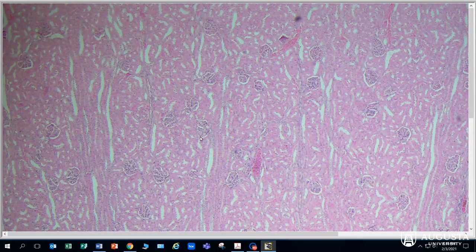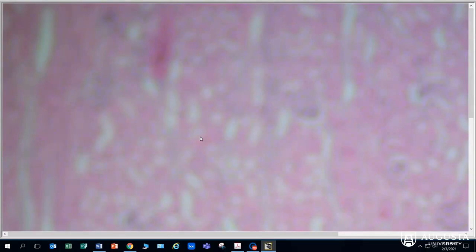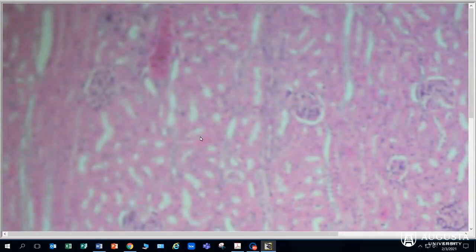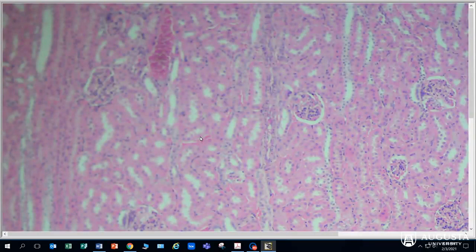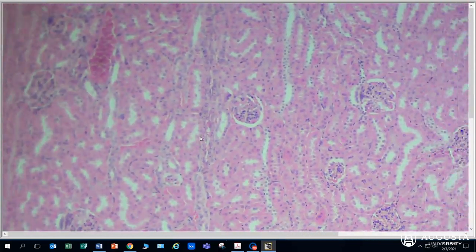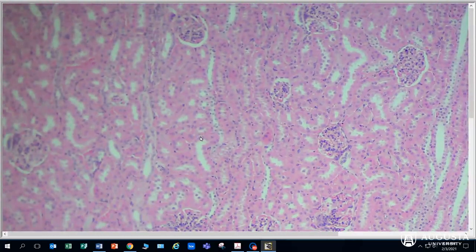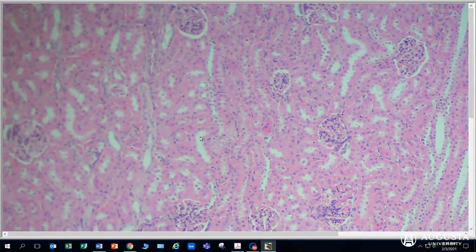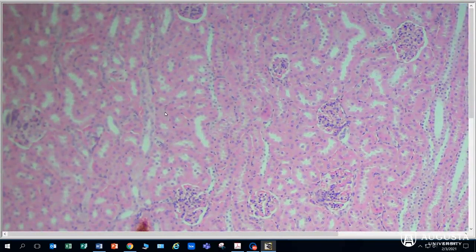We're going to pick one. Right now I'm looking at the 4x objective. If we switch to the 10x objective and focus, we can see those structures a bit more clearly. I'm actually going to move the slide just a bit so that I can bring some of these into focus. What we want to look at is the layer of cells that surrounds this structure right here.